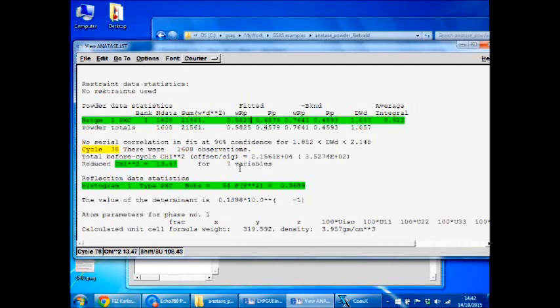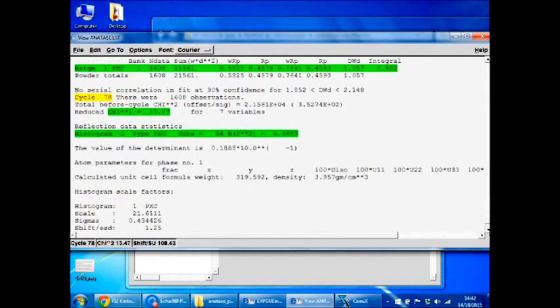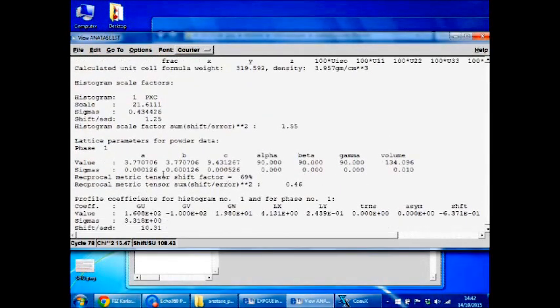We didn't get it to fit very well to the model. And also if you scroll down, you've got your A, B and C, that's my unit cell parameters of my tetragonal anatase unit cell, and the error associated with each value is quoted below. So that's also interesting to have.